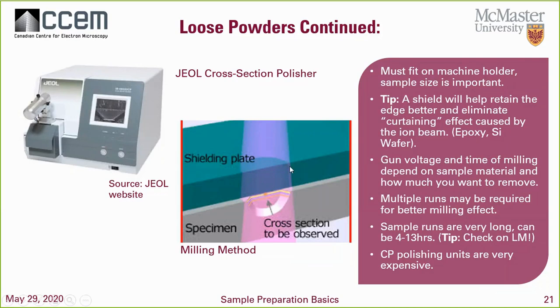Now, in this powder, it's not so crucial because let's say if I was using this cross section and this was my powder, I could look at the powder here, here, here, here, here, any area down the cross section that we just made. Okay, that's the good thing about the loose powder method.